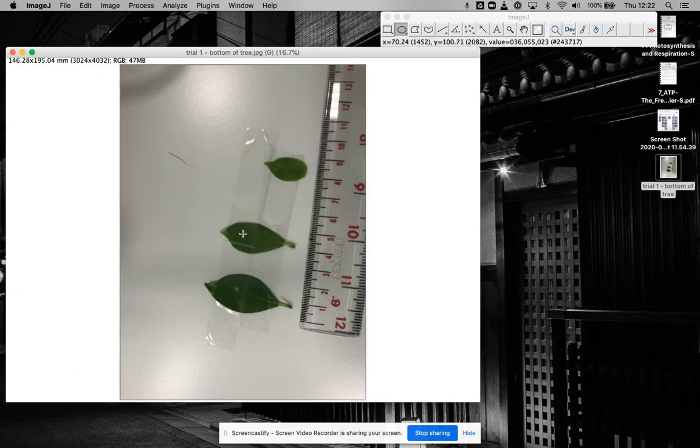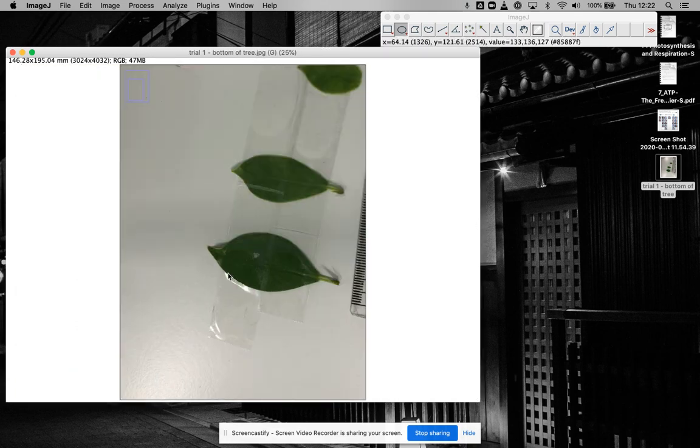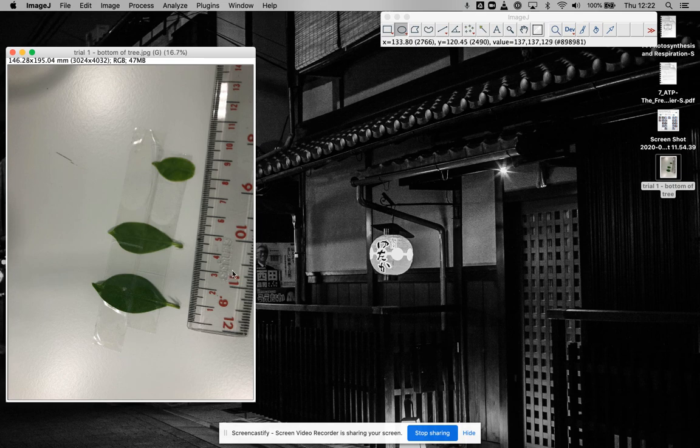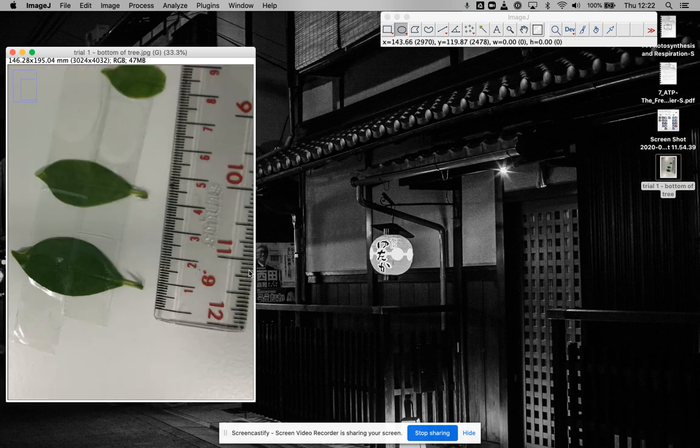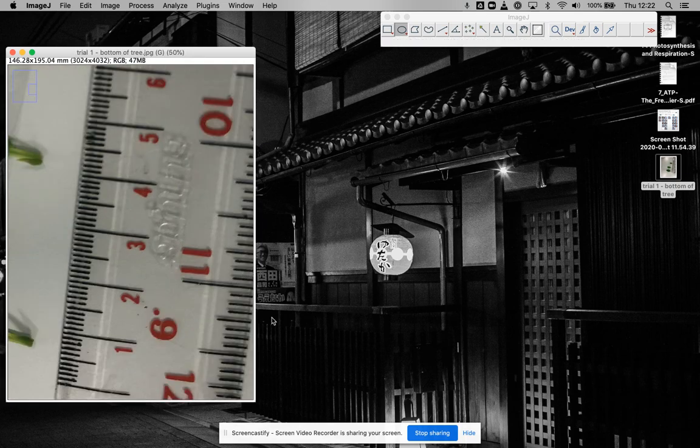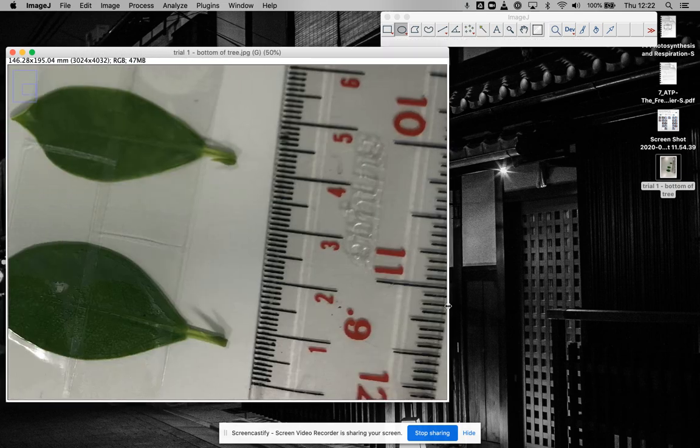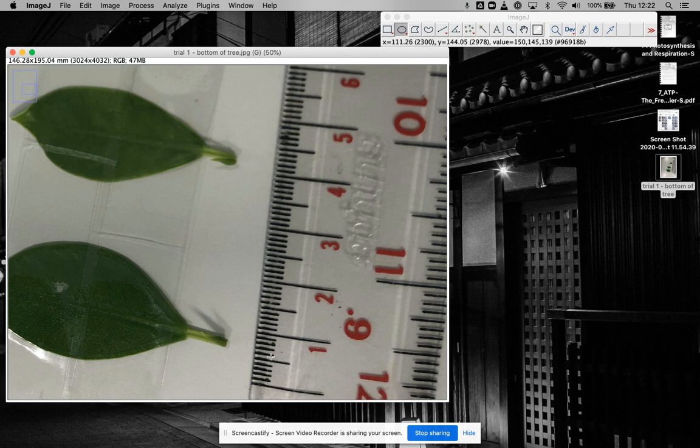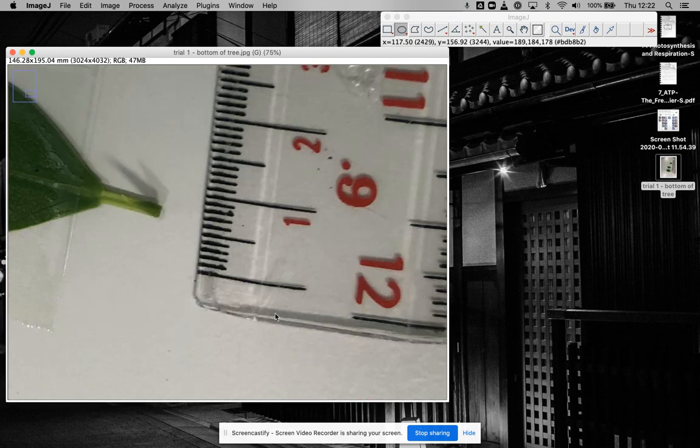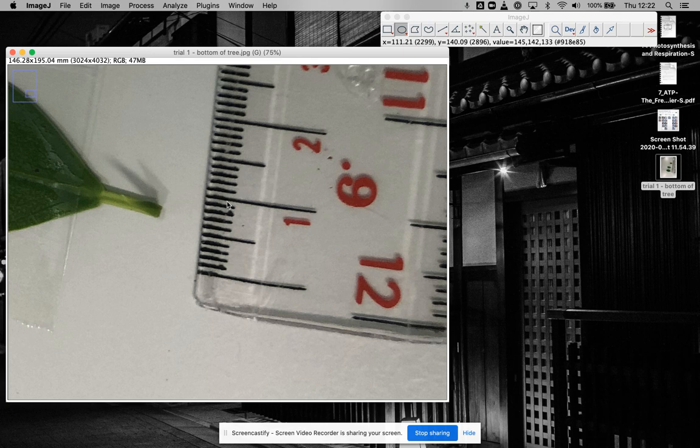I'm going to measure something on these, but before I can do any of that measurement, I need to set a scale. I zoomed in on this picture a bit. I'm going to zoom in a bit more. What I know is that the distance here to here is one centimeter, or 10 millimeters.